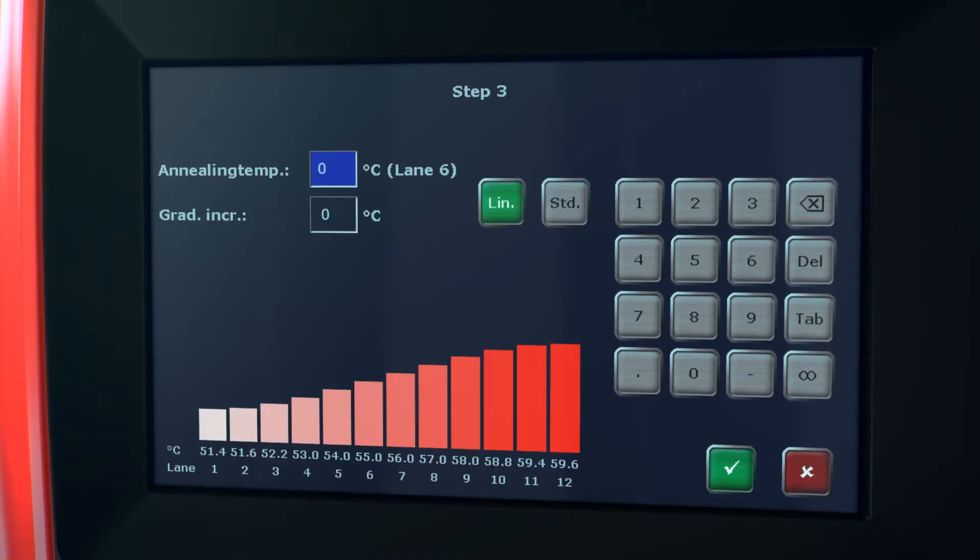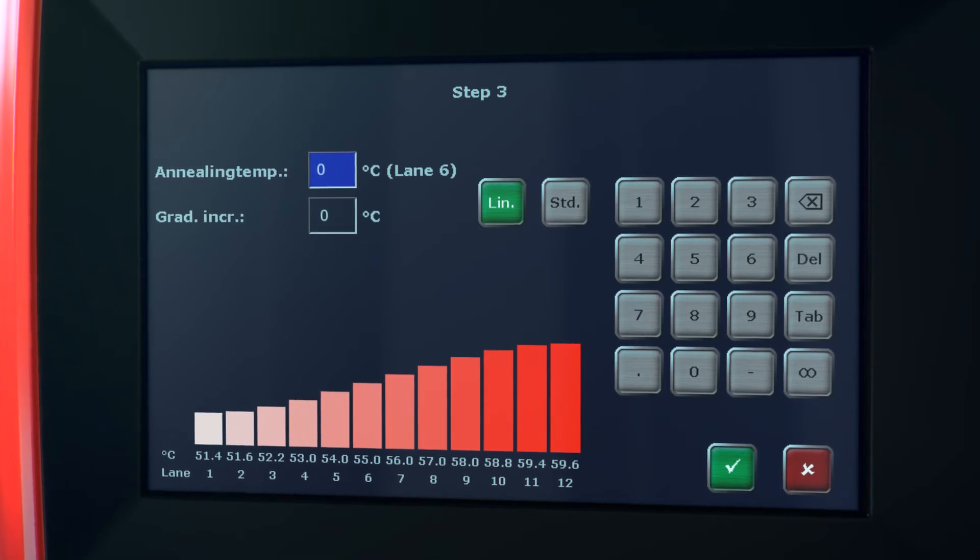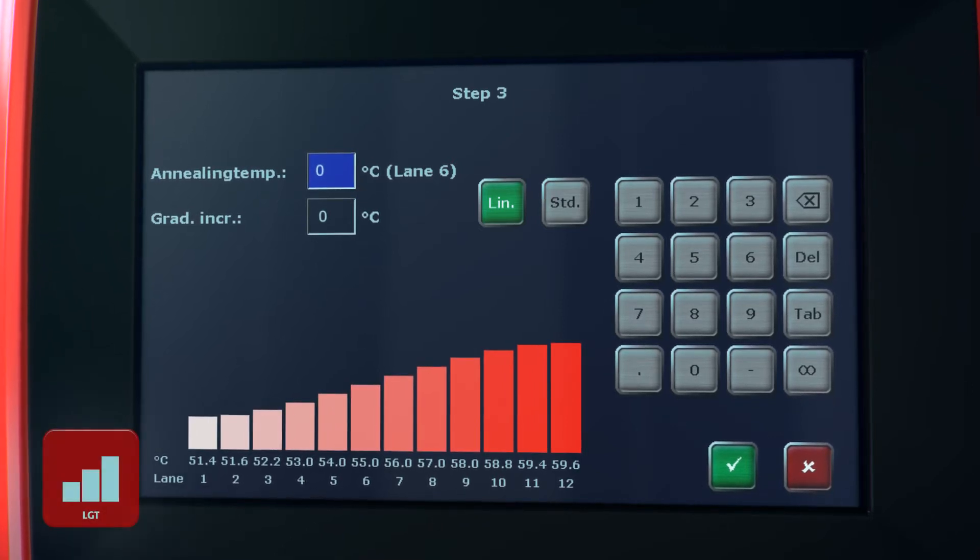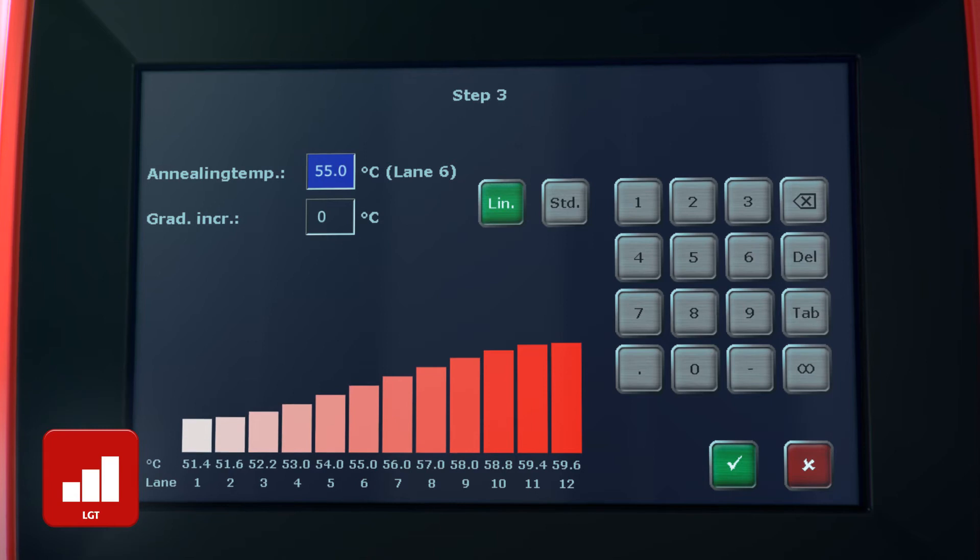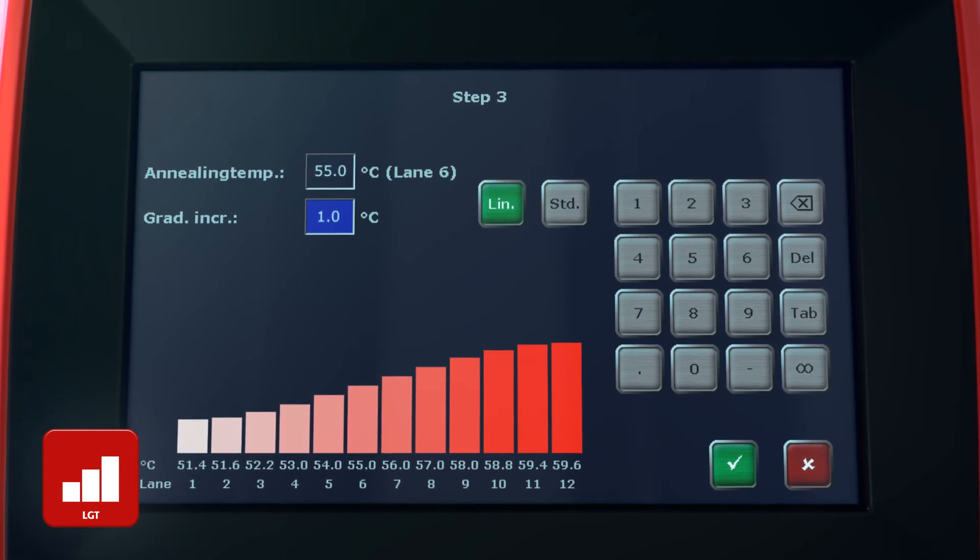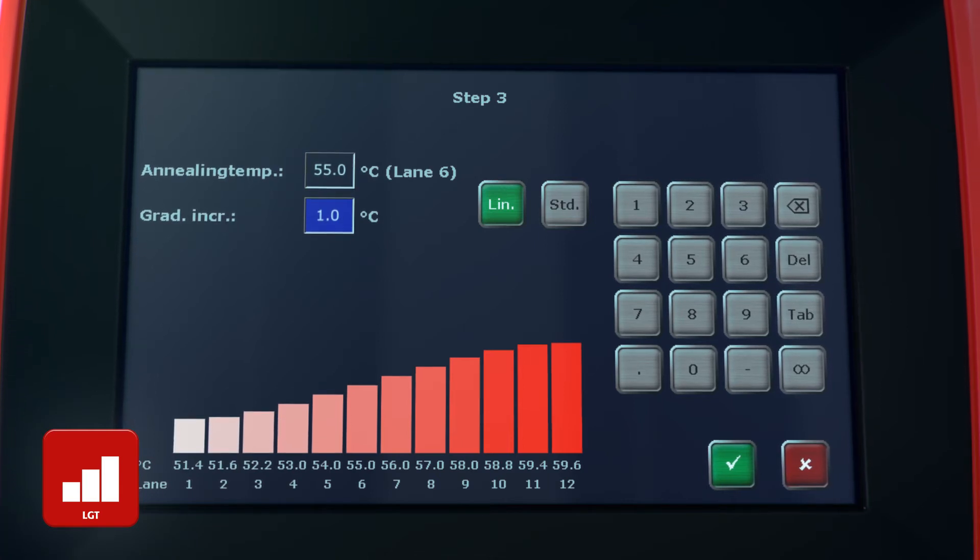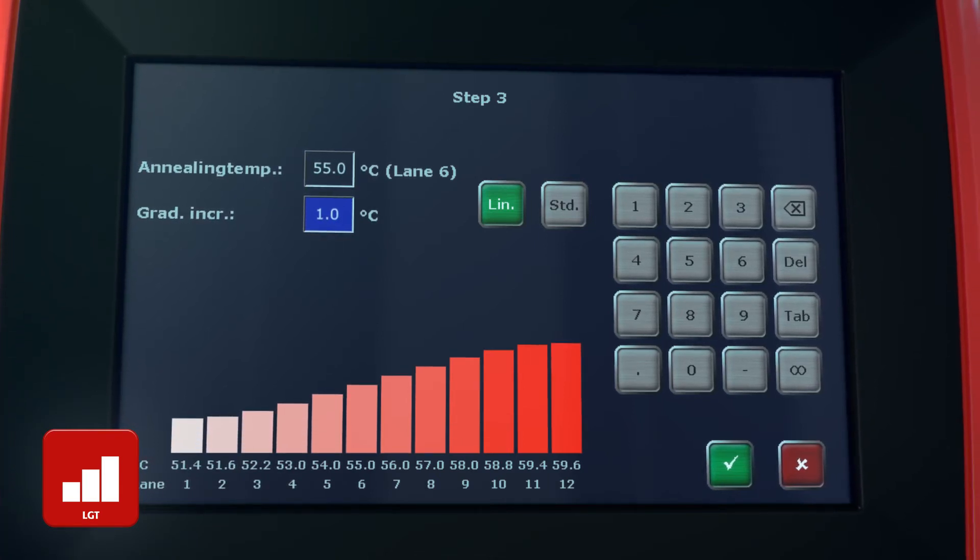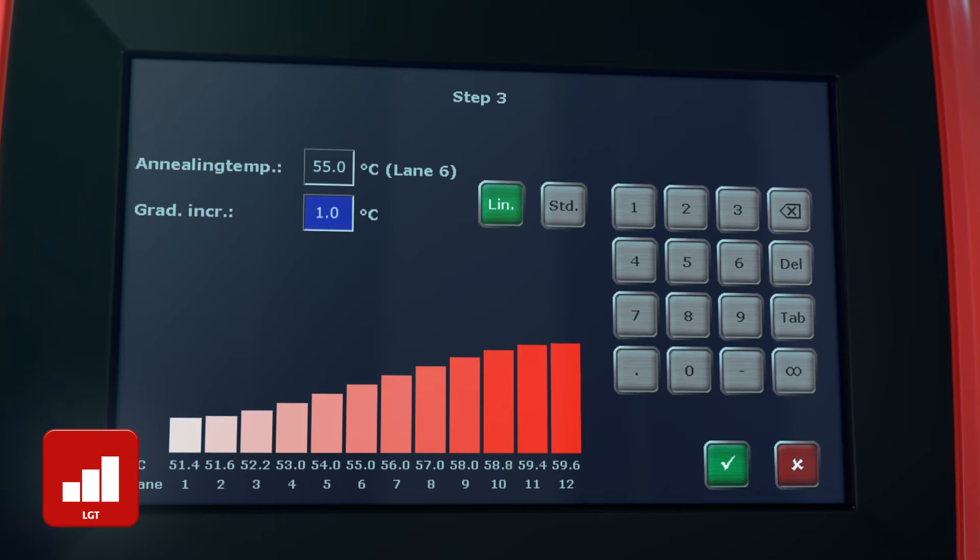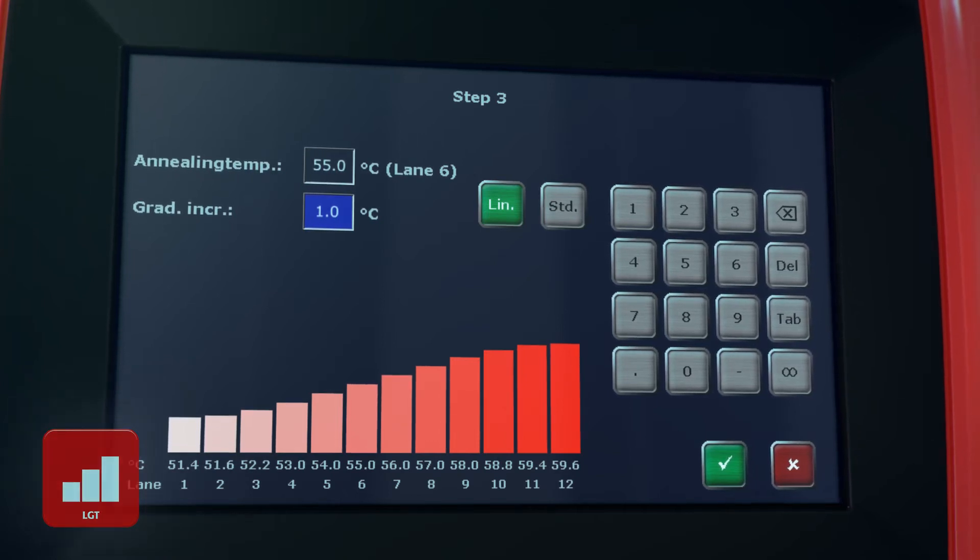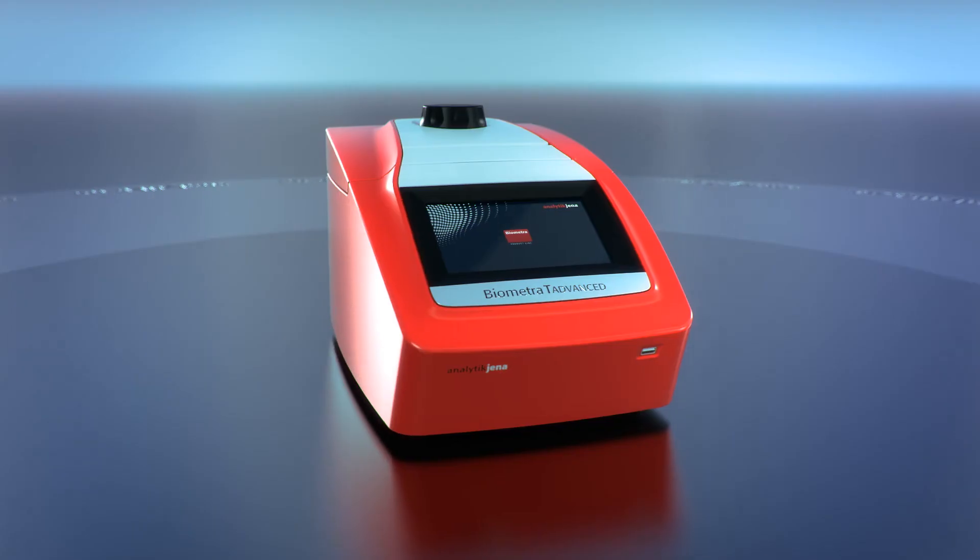Determining the optimum annealing temperature is a challenge when creating a new primer pair. The linear gradient tool enables programming of a temperature gradient with defined temperature intervals between the individual sample block rows. For maximum comfort, the linear gradient tool supports programming of even numbered temperature values by entering the calculated primer annealing temperature and the increment.